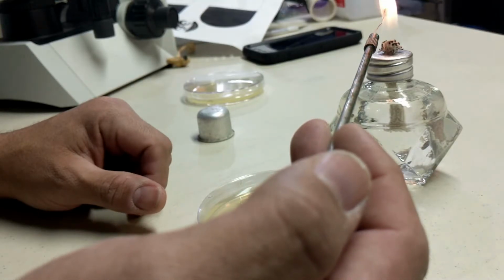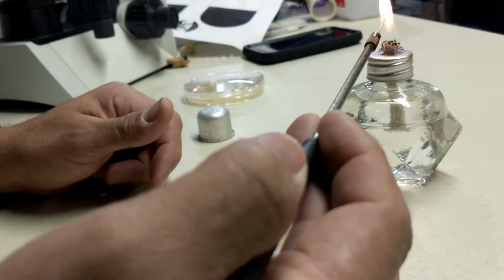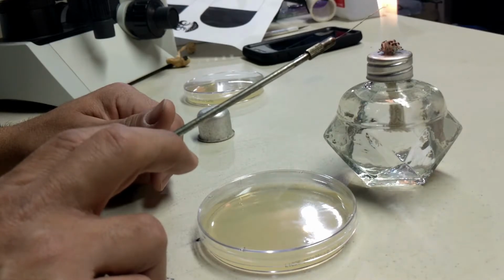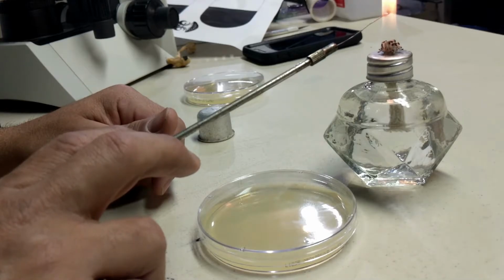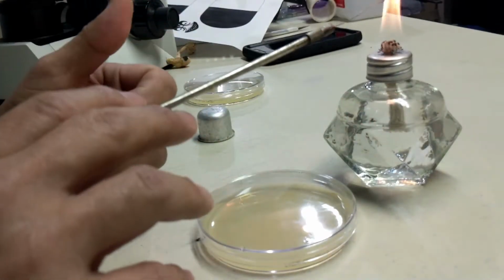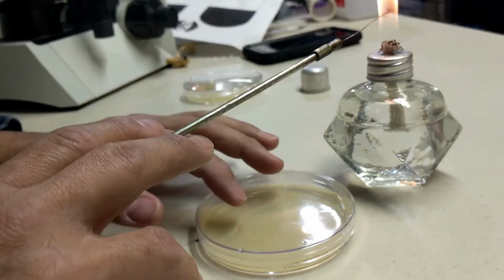So as soon as your loop is hot, then of course you can continue. So how do you know it's hot? Two things. You can put it here and then you literally wait until it's red hot. Another technique, a good technique, would be you get your fingers and touch it, and if it burns, then it's hot. No, please don't do that. That's a dad joke in there.